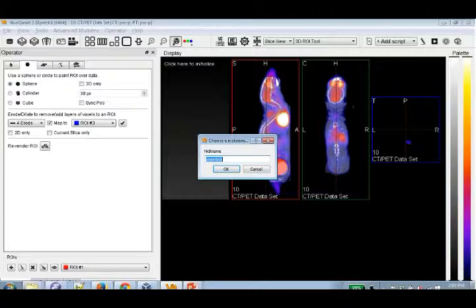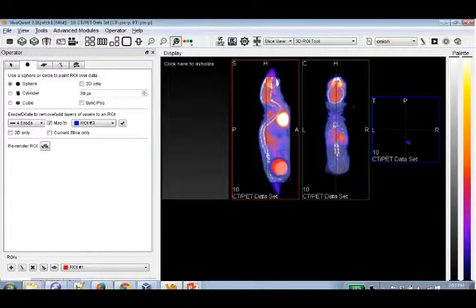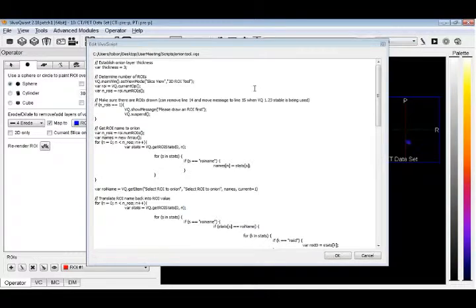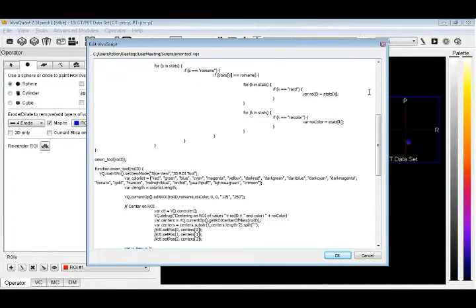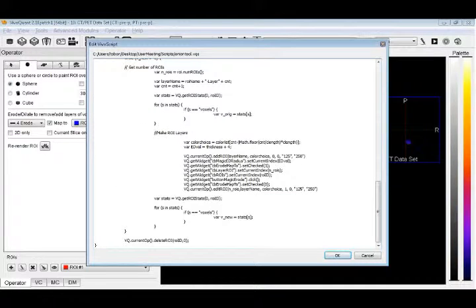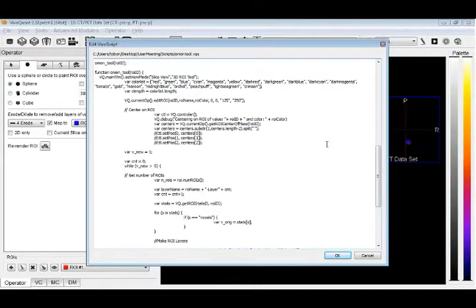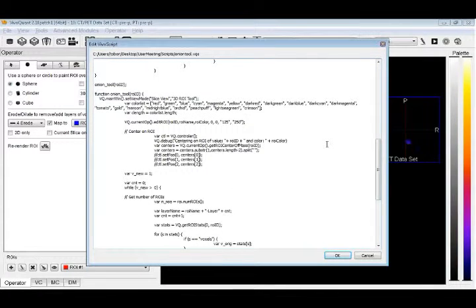I will use such a thing, and call it onion. All right. So now that appears in the dropdown too. And I can edit it here. So here the thickness is 3. And you can look at your entire script here. This may be a little bit confusing, but Gabe will talk about what it all means pretty soon.